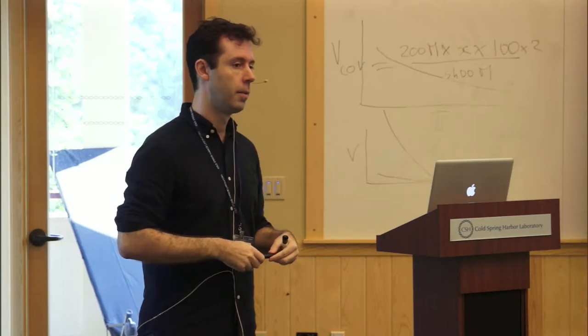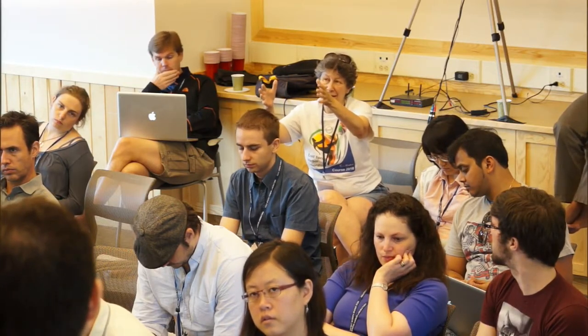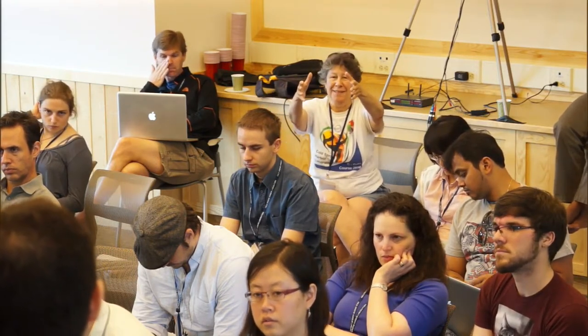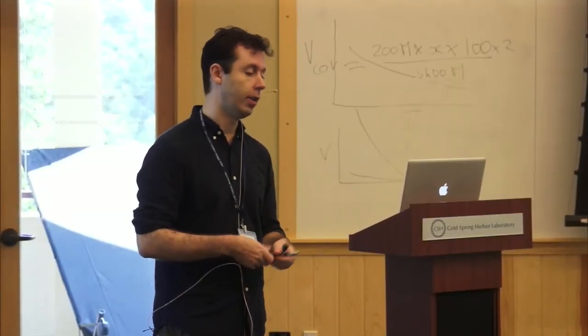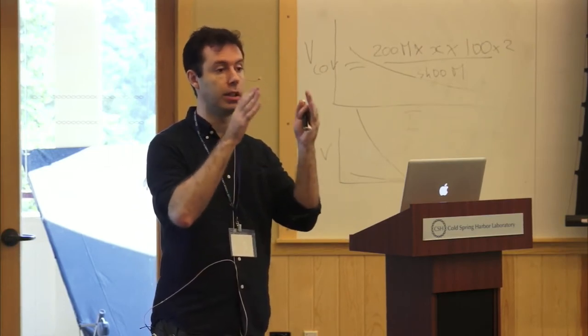Oh, I didn't mean that. I meant multiple mapping. Okay. Especially if your mapper randomly assigns, then in a sample in which that region that's very similar tended to get more fragments, they're going to appear to be amplified over many homologs, whereas in another sample where a less similar region was more amplified, it'll all concentrate on the actual one. No, look, there are ways to work around this. And I think one way to go about this is to focus on the regions that are unique, right?